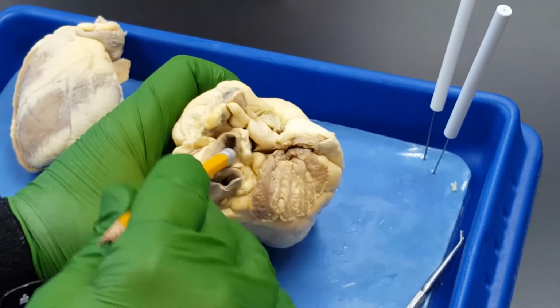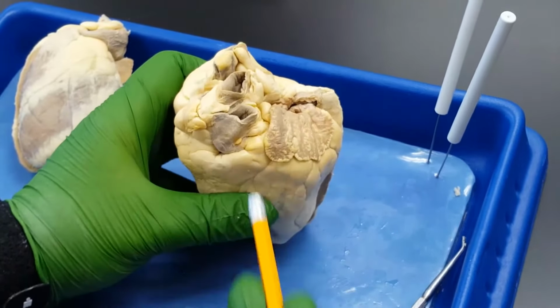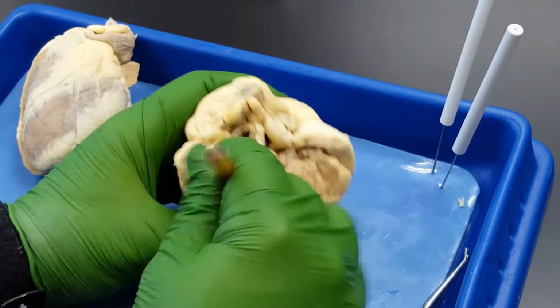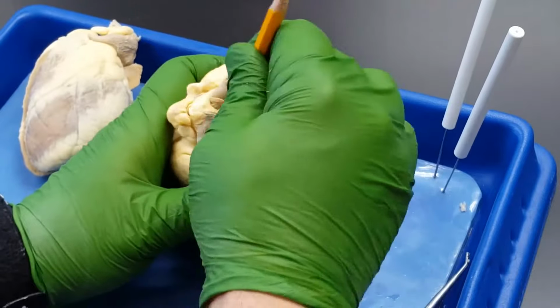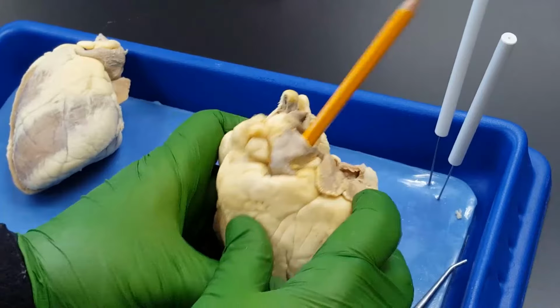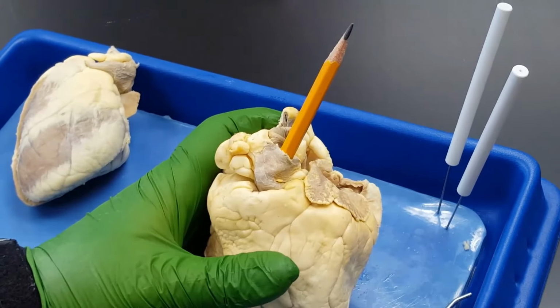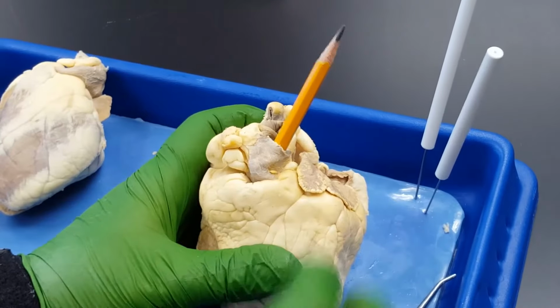This is the great vessel I just stuck my pencil into. Here's another one. Notice it's the most anterior. So I have a good suspicion what this one is, but I'm going to go ahead and wiggle my pencil into it. And notice this one suddenly skews to the right. Remember my wording from before. This great vessel goes kitty wampus over here to the right, and I can feel, you're not here so you can't feel, I can feel that I've just entered a chamber.